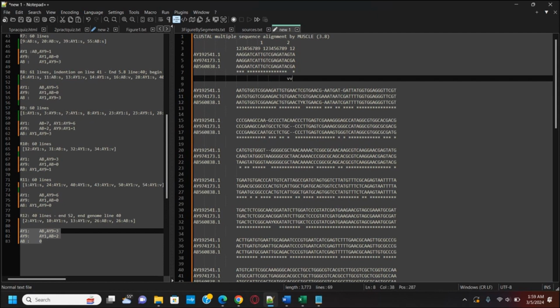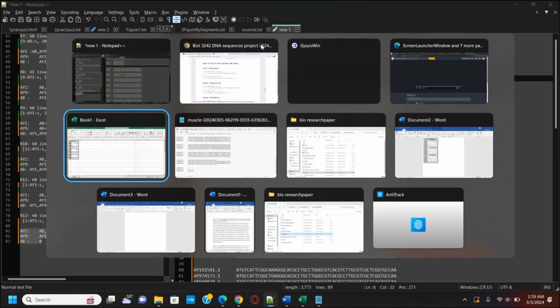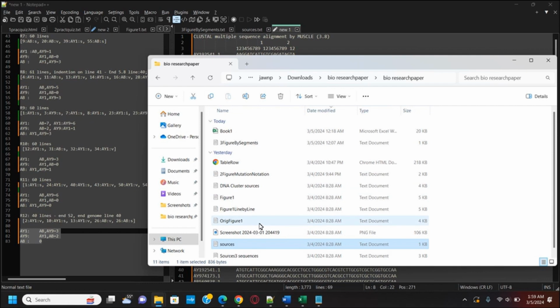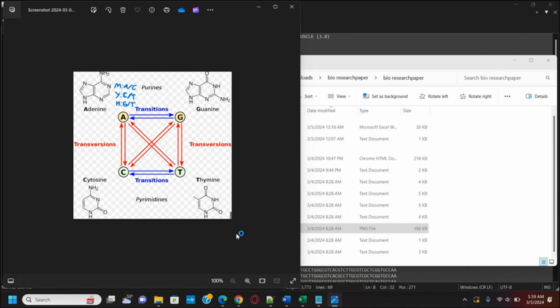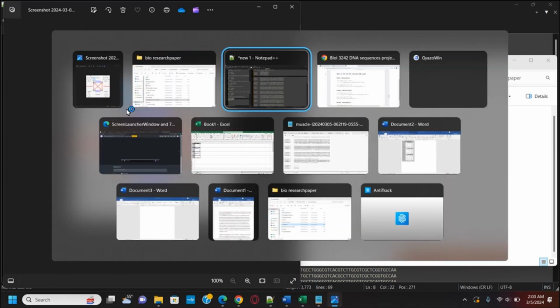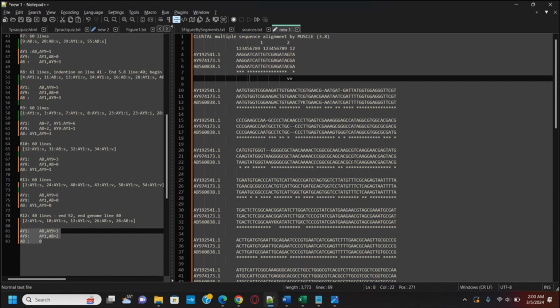These were Y's, I can remember. Can't remember what A and G is. I think I have it over here. Yeah, I took a picture of it. Oh, one of my species is a clone. So K is a degeneracy of what was it? I think it's either G or a T. It was a degeneracy of one of those. Let's see.